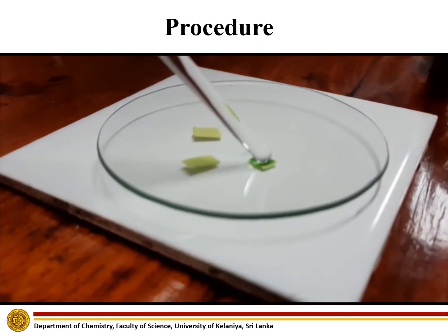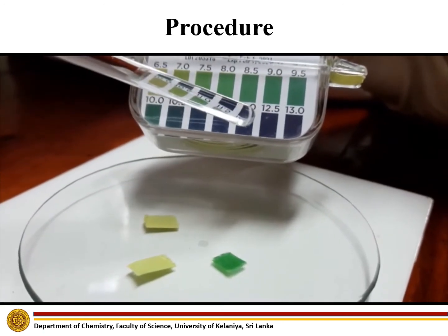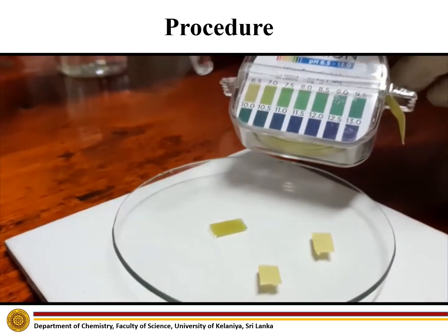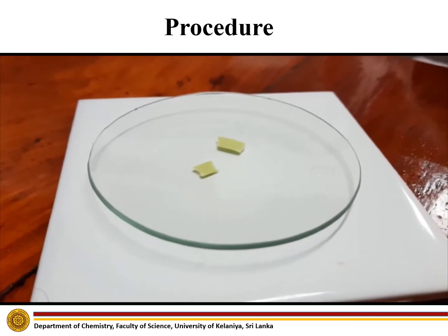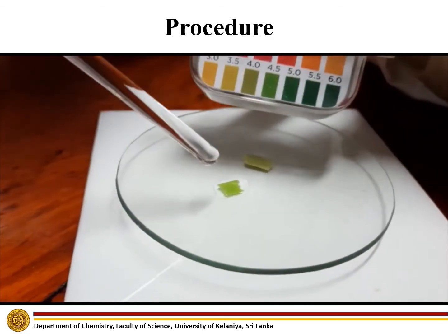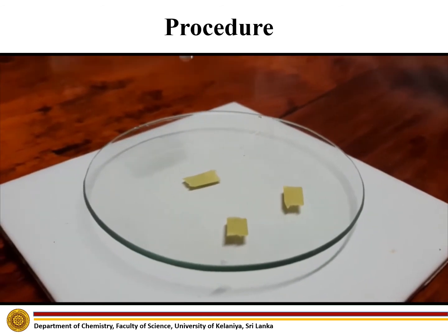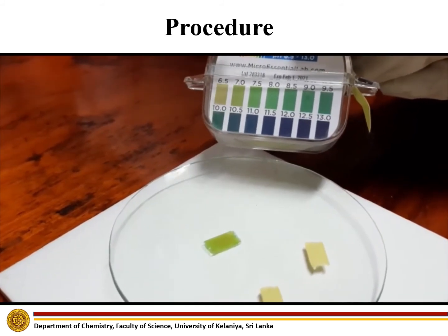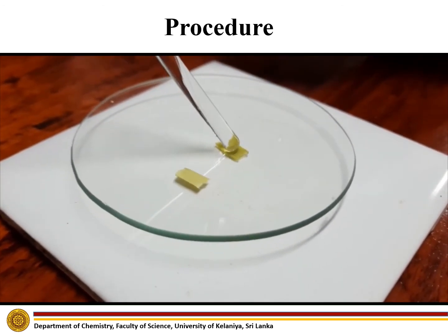Next, when the pH of sodium acetate is tested, it was about 9. The pH of ammonium acetate salt is approximately 7. The pH of magnesium sulfate salt is close to 6.5 to 7. When the pH of ammonium chloride salt is tested, it appears to be approximately 4. The pH of sodium chloride is 7, and the pH of distilled water is 7.